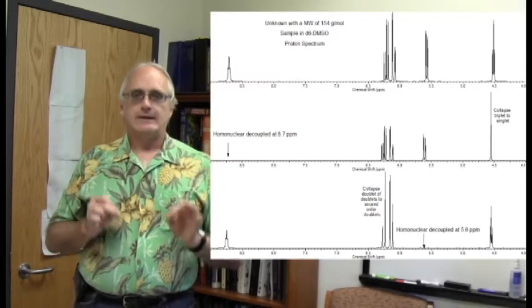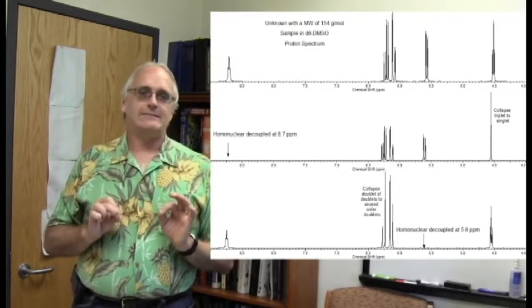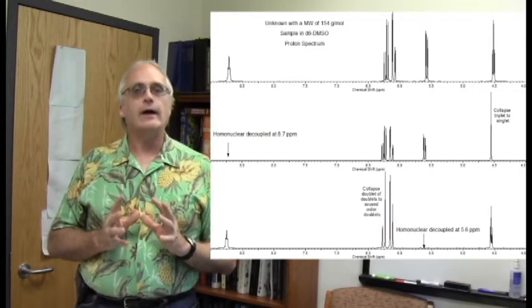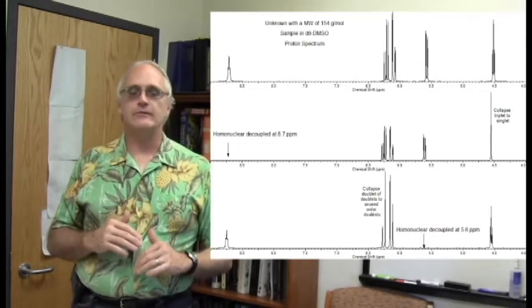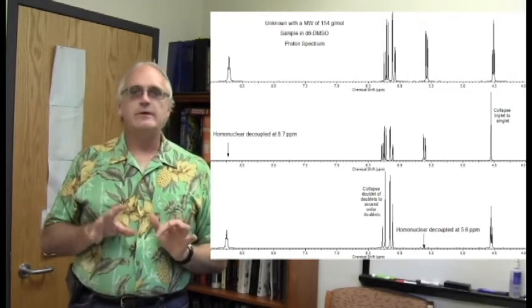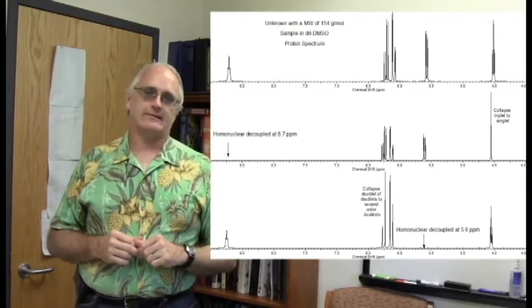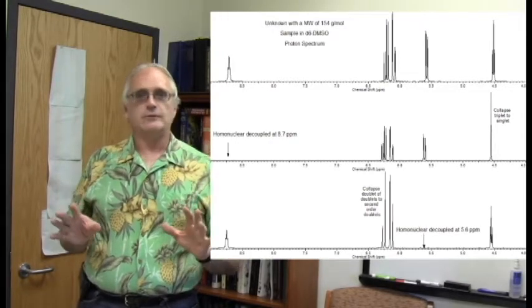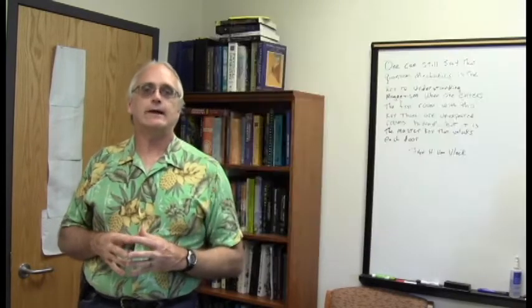These are 2 chemically distinct protons, but they seem to have a chemical shift very close or within the order of magnitude of the coupling constant. There's that ratio, frequency difference versus coupling constant, and it seems to be hovering right around that magic value of 10, and we're seeing the onset of second order behavior, where the outer peaks of a multiplet shrink, the inner peaks grow. Kind of interesting to see that happen here.